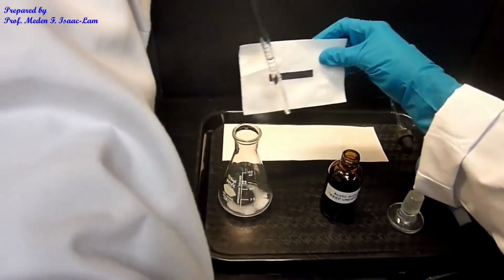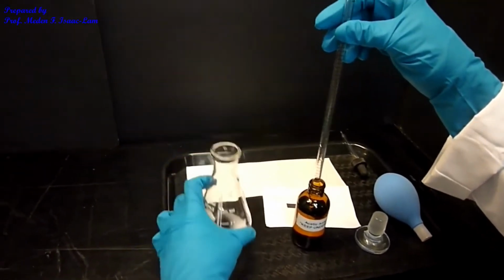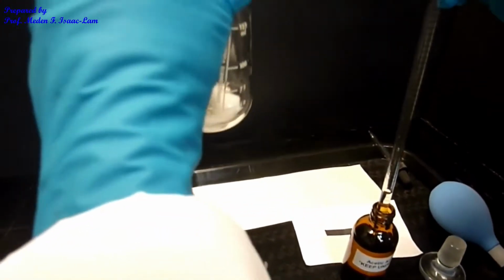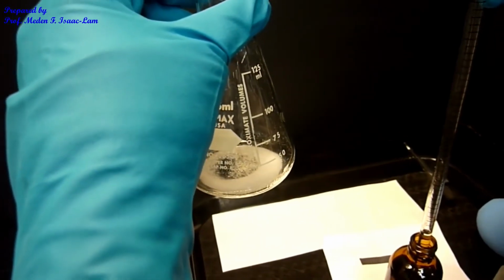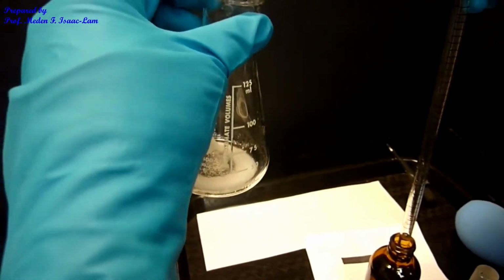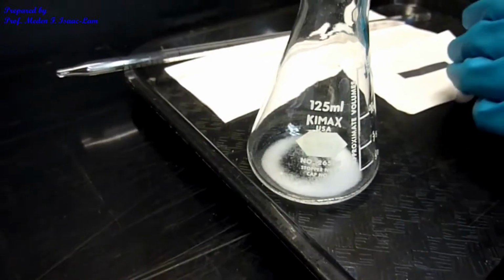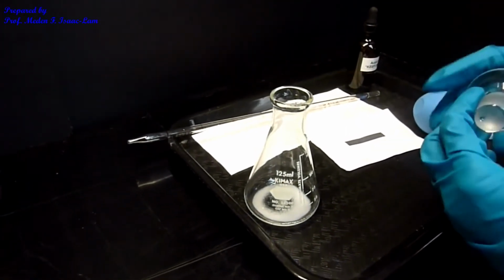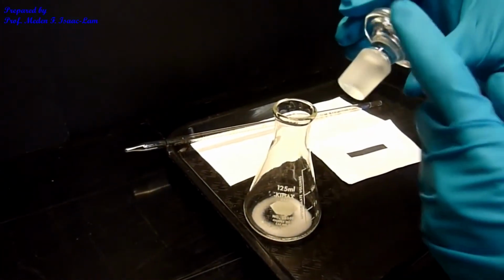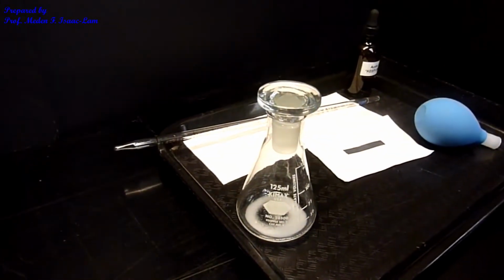Okay? And that is our reaction mixture. So no solvent, it is just the reagent, the reactant, acetic anhydride, and then the salicylic acid. And then I'm going to loosely cap it using a glass topper, and then we are ready to microwave.